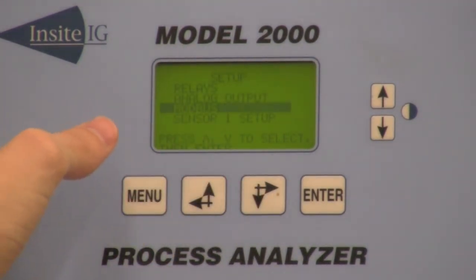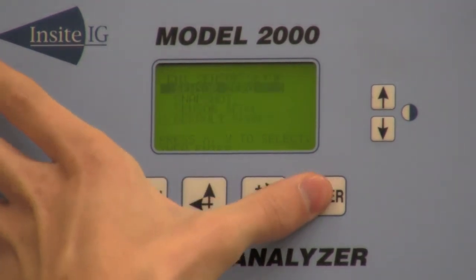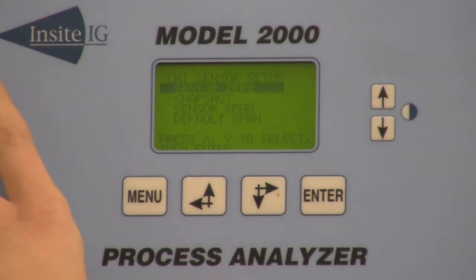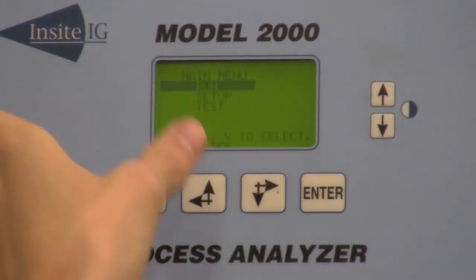Then you're going to back out and you can set up Modbus if you're going to use Modbus communications. There's also a sensor one setup which allows you to come in and actually recalibrate the sensor, which you will have to do periodically every one to two years.